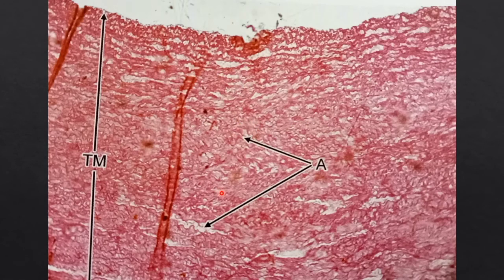So you can identify the entire, this is nothing but the tunica media. You can see these arrows showing the tunica media, and it consists of a large number of elastic fibers. Can you see these are all nothing but the elastic fibers? This gives you a clue to identify the large size artery or elastic artery. So as a landmark, you can easily identify the elastic artery.